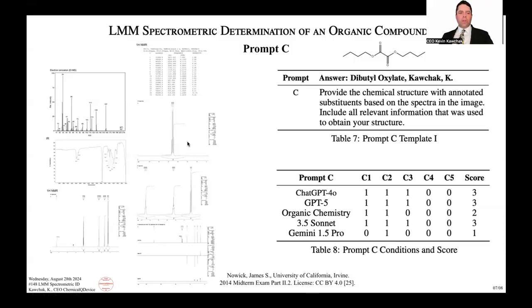Now, if you look at this peak here that looks like a quartet, I actually was not sure about that, because it integrates to 4, and I was almost 100% sure that this was the structure. Now, if I took this particular clip and gave just that spectrum to GPT-5 with nothing else about atoms or anything, just the spectrum, it immediately saw that this is not a quartet.